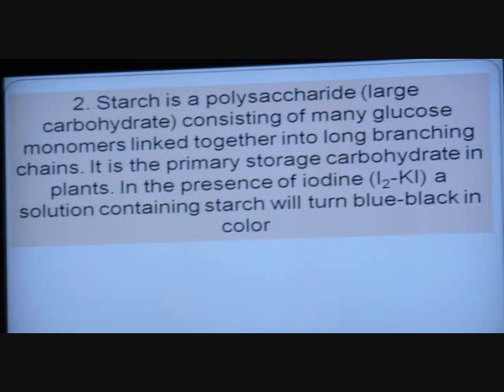I'm hoping that iodine back there is not black already. If it's black already, that's going to be a problem. You want to see a change. And that's why I realized the Sudan solution, being red already, works better on that paper towel. When the water evaporates, it comes to a nice light pink color. But the fat doesn't evaporate, the fat stays there.